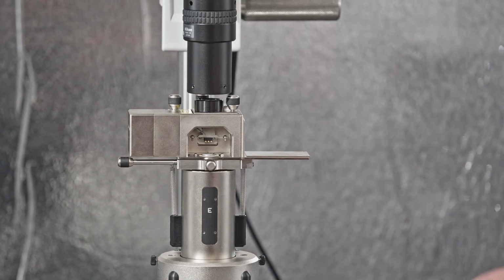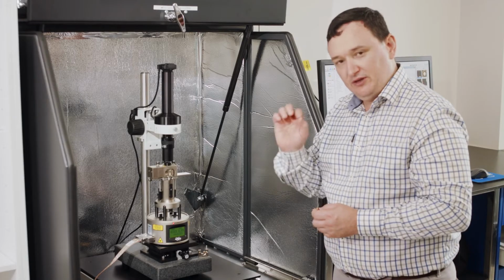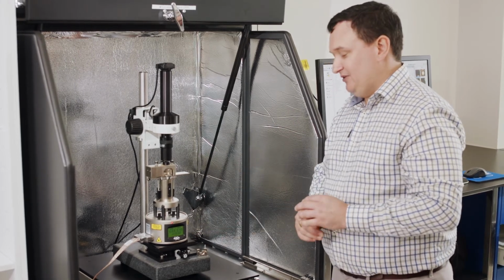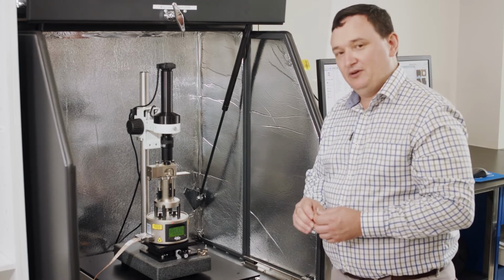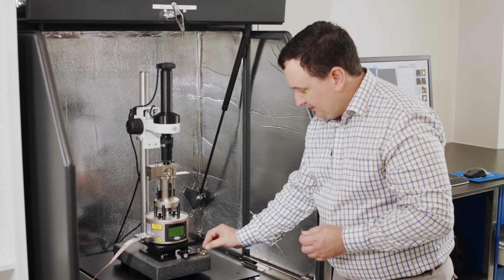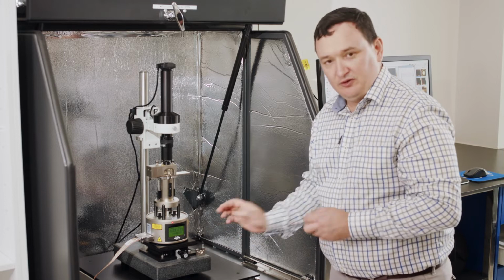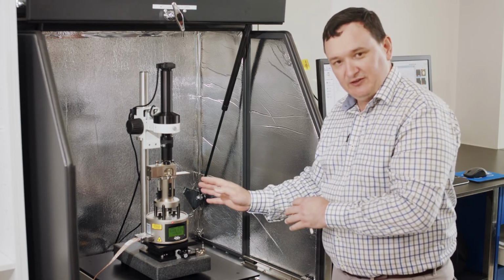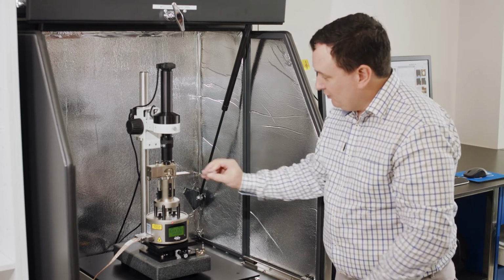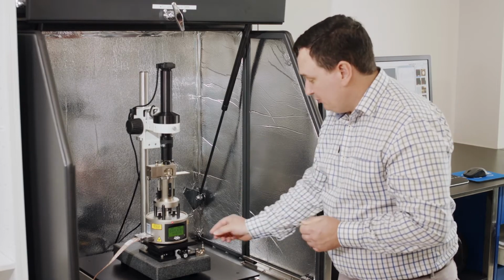Now, as we mentioned before, you should be aware of the sample height. When you're changing samples, the thickness of that sample matters. I know in this particular case, the sapphire sample is slightly thicker than this low density polyethylene sample, so it's safe for me to put this probe holder back in straight away. But it may not be the case for your sample. So just remember when you're changing samples to be conscious of the height of the sample relative to the 3 balls that are inside the system, like we showed you before.